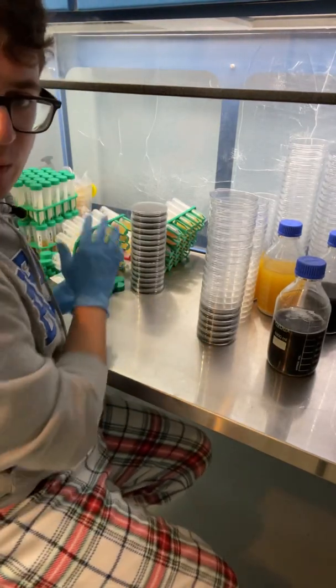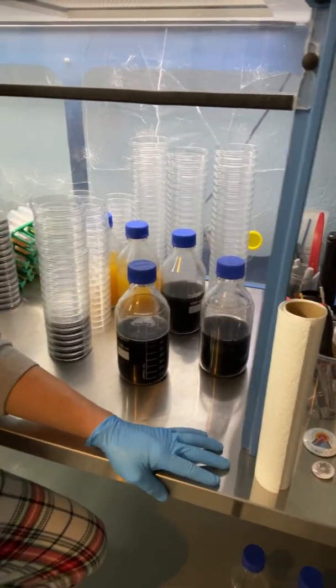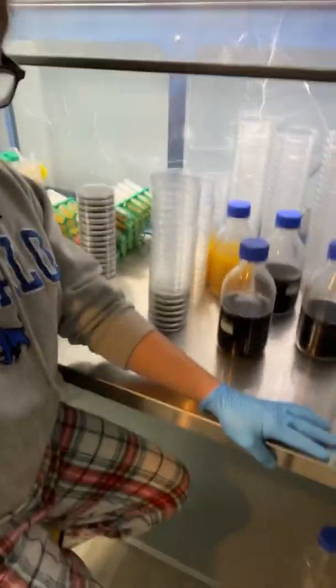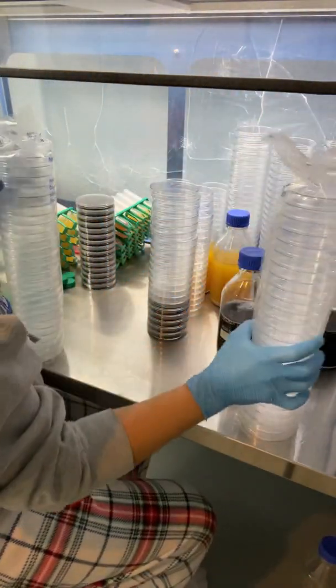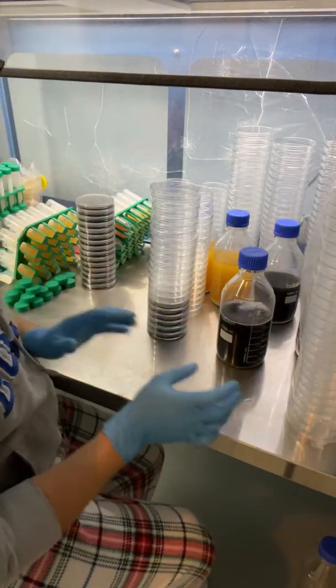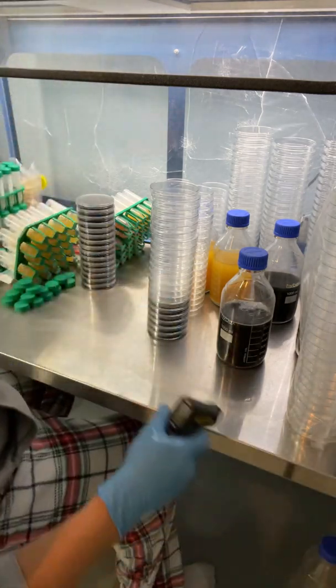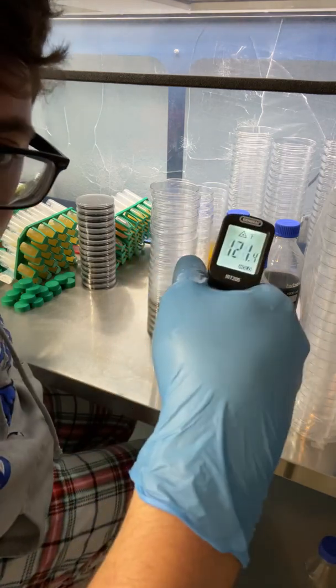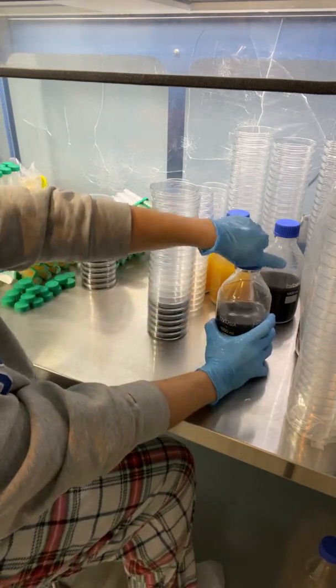What's up guys? I just finished pouring some slants. I've got a bit of extra agar left over here so I thought I would see how many plates I can pour while I'm waiting for it to cool down. I've got some backup sleeves that I'll leave off to the side and I did about five liters of agar. It's right at 121 — that's where I like it — so I'm just going to go through my standard pour.